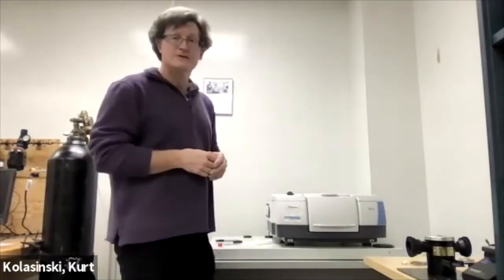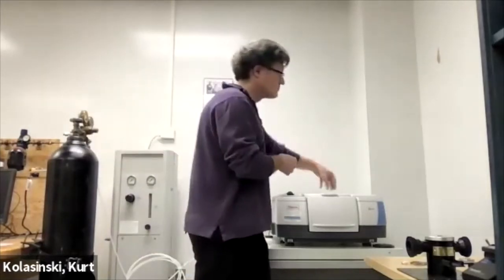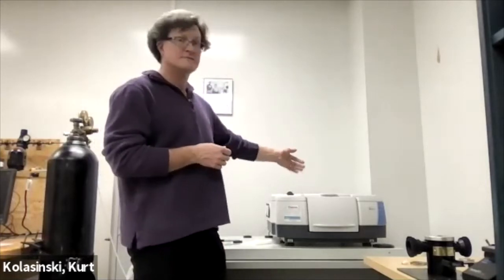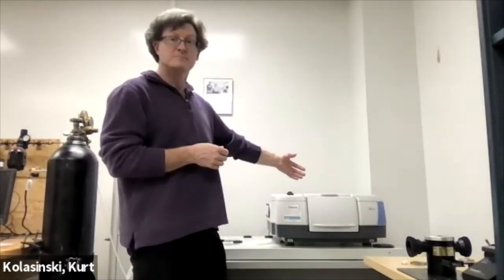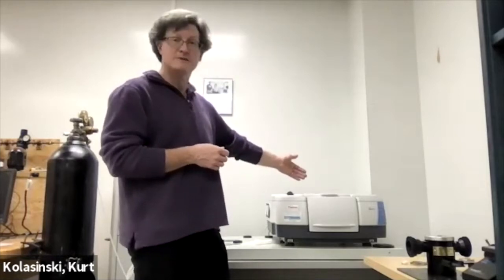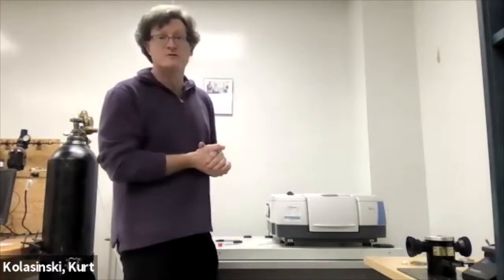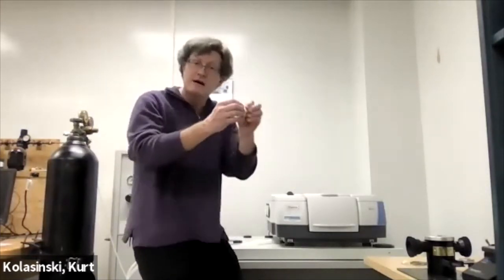And for the high resolution one, I did the same thing. I opened it up with the sample in, and I put it in there, and then took the spectrum of the high resolution one after waiting 5 minutes again in order for the whole thing to be purged out again. How long is long enough? Depends on how good of a background you need, right?